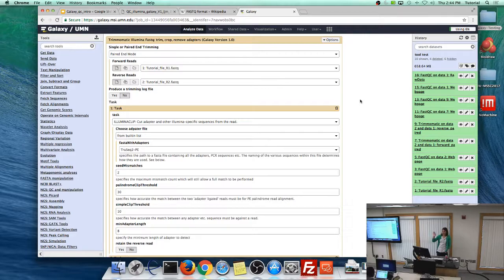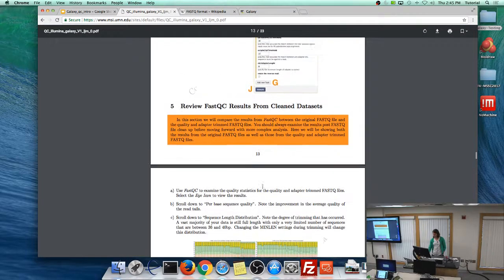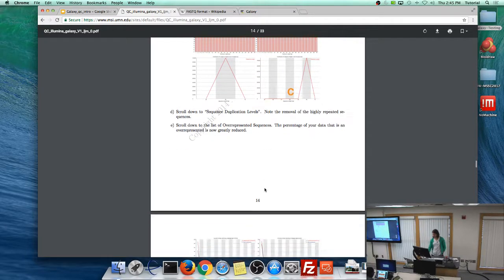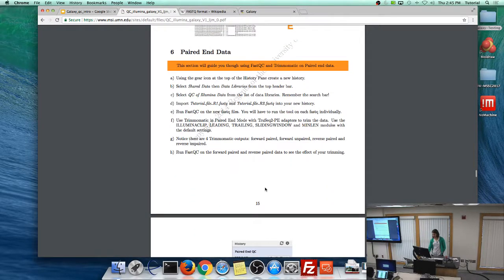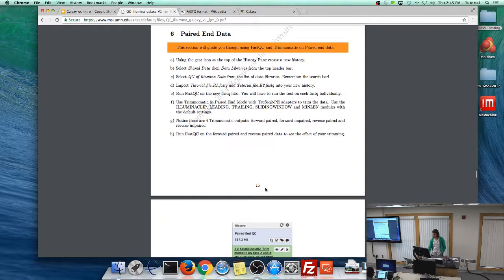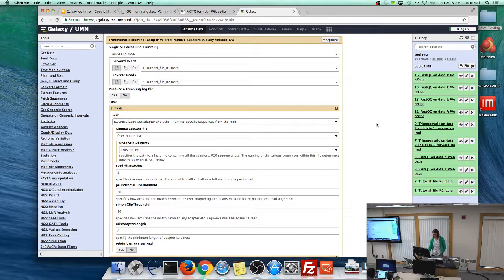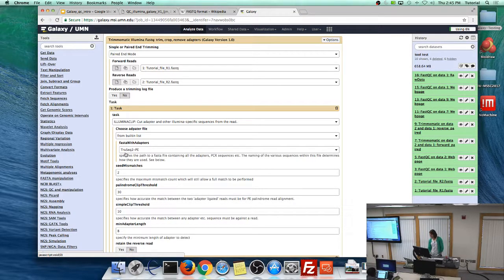For paired-end Trimmomatic, run it in paired-end mode. Give it Tutorial File R1 as forward and R2 as reverse. Add the Illumina Clip task, but this time use the TruSeq2 PE adapter instead of SE. Then add Leading, Trailing, and Sliding Window as before. For minimum length, these reads are 100 base pairs, so something like 80 or 90 makes more sense than the default 40.